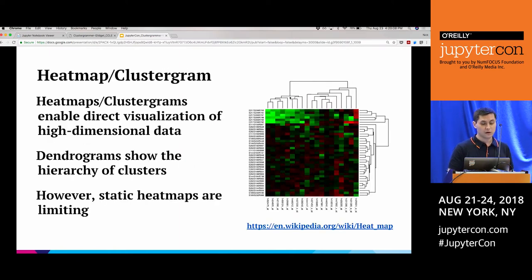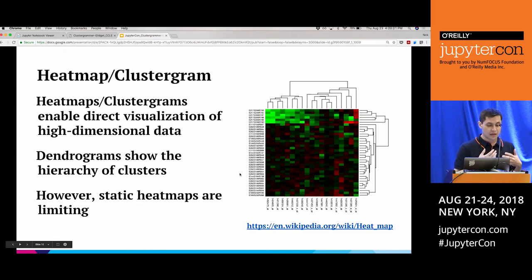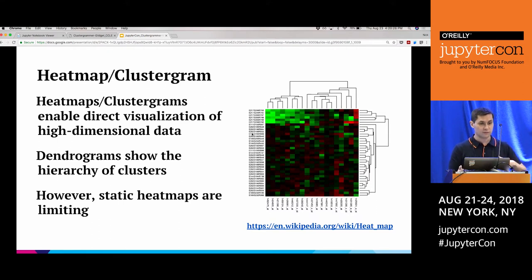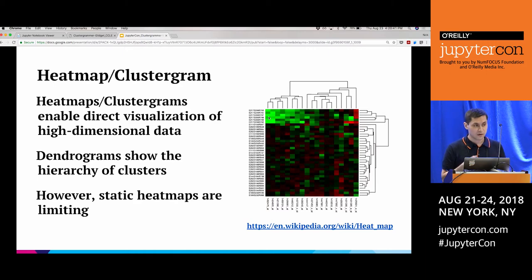As an alternative, we can directly visualize the data using a heat map. In this toy example, samples are rows and genes are columns, allowing direct visualization of high-dimensional data. The arrangement is usually done through hierarchical clustering, and a dendrogram shows how clusters form at higher levels. However, static heat maps are limiting — as you add more data, components become smaller and it becomes harder to extract useful information.